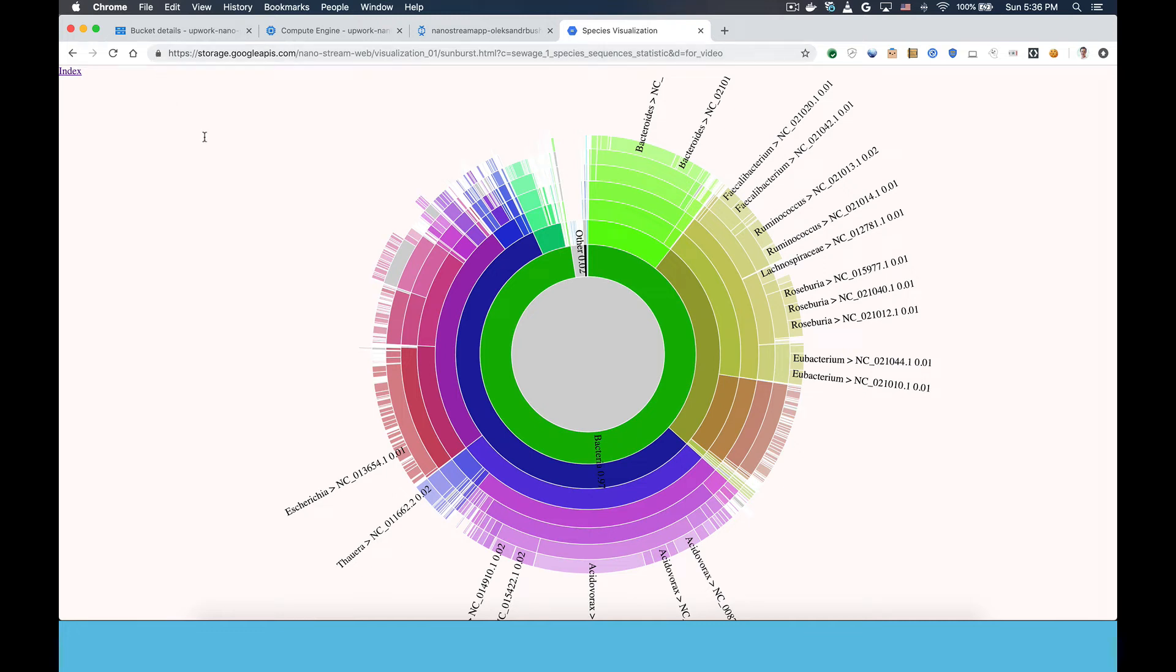Hi, this is a demo video of a real-time streaming analytics system we built for nanopore sequencer data. All of the code used to build this is in GitHub and there's a corresponding blog post on the Google Cloud data and analytics blog.